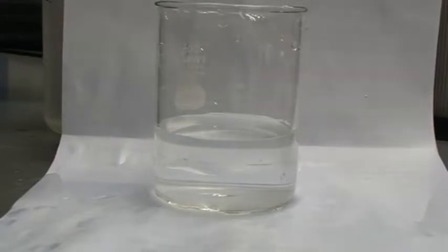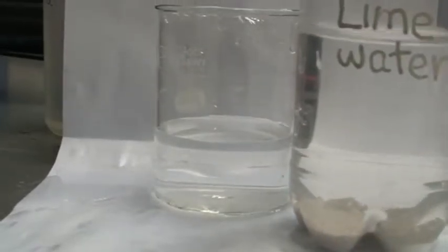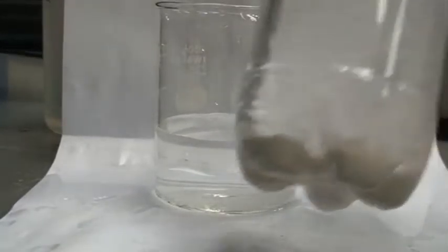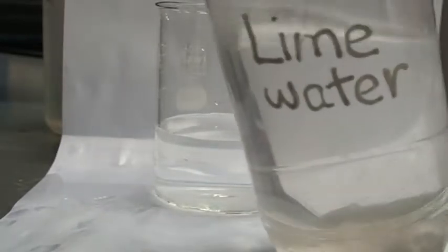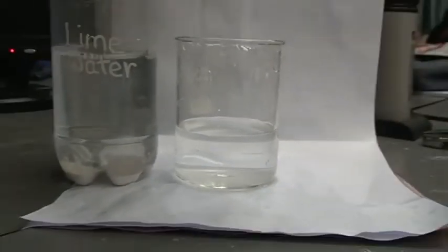This is saturated lime water. How do I know it's saturated? This is because there are some solids inside here — you can see the solid. This is solid calcium hydroxide, and I just poured the lime water out like this.